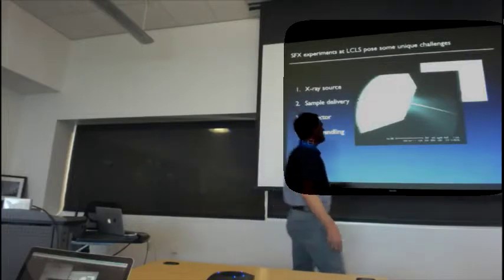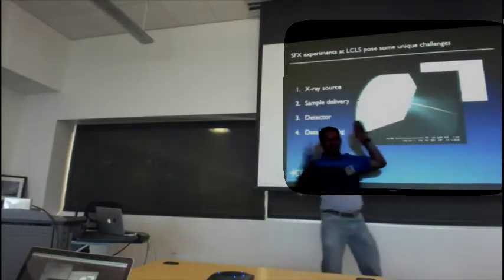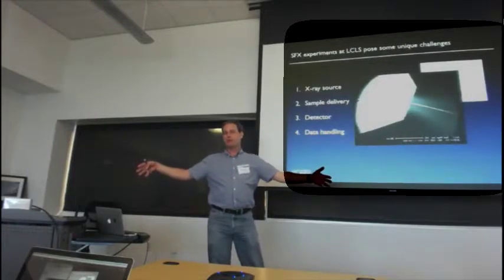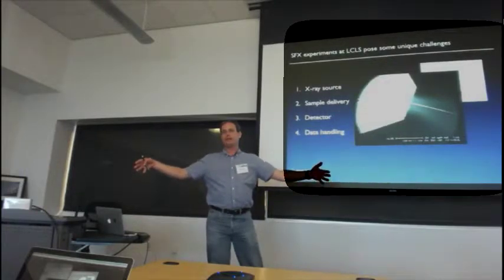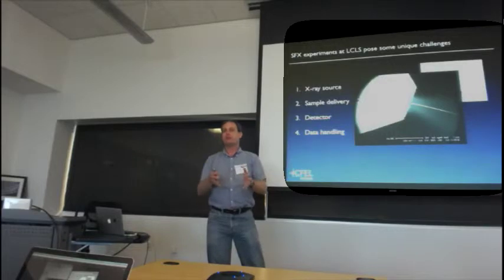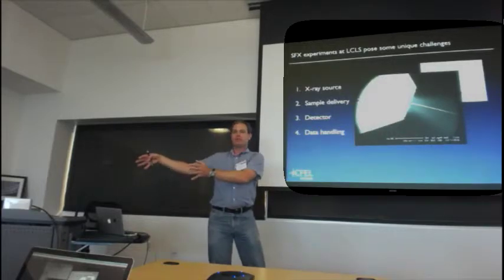So the first thing you think is, well, okay, let's just throw away the frames with nothing in it. You know, why are we even saving these things? And that's part of what this pre-processing step does, okay. It says, let's quickly look through the data and see which ones have plausible crystal diffraction that I want, and let's keep only those frames and take those home and do the subsequent analysis on it.